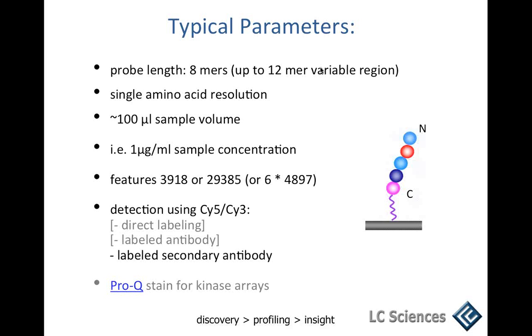Beyond that, the yield simply drops dramatically. If, on the other hand, you have constant regions for all peptides, let's say a 5 amino acid common sequence, then we can certainly add that at the C or N terminal using standard chemistry.